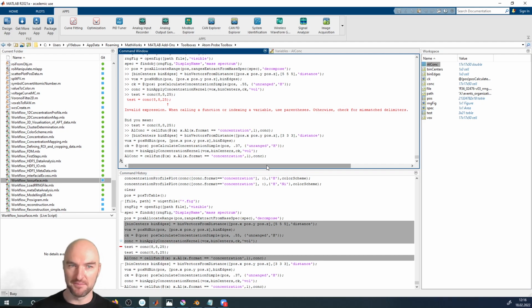So you can see, the smaller the voxels are, the slower it will be, obviously. So we now have 10 times as many voxels as we had before. I mean, 8 times, but now we went with 3, so maybe 5, 6, 7 times more. But that grows pretty rapidly. And this is why we still offer the direct voxelization option as well, with the Isosurface workflow that I've shown you earlier, because that one is relatively quick. It just goes in and counts how many atoms of a certain type you have in a voxel, and that goes very quick.